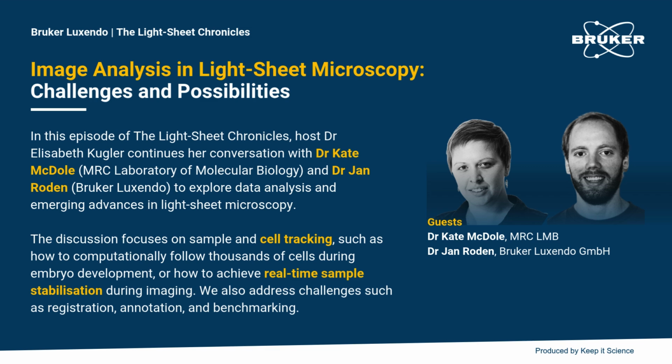And you mentioned registration. So I want to use the next few minutes to talk about the importance of registration. Jan, what type of registration do you use and what challenges do you face? Yeah, I think, to me, from a data processing perspective, registration has always been the most challenging part of the pipeline. I don't know if you agree, Kate, but for me, it's such an important basis for everything that follows.